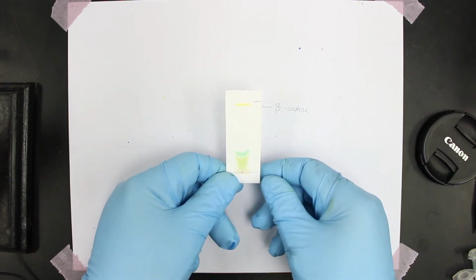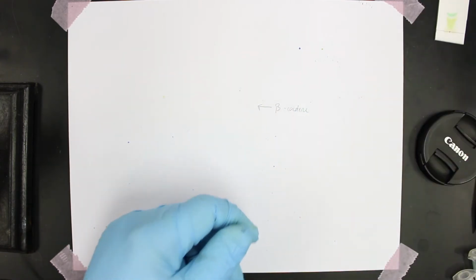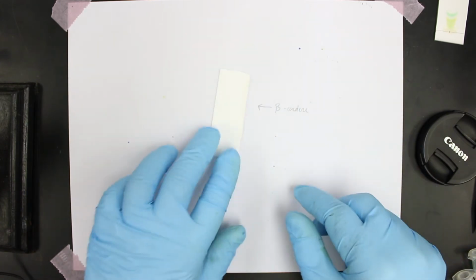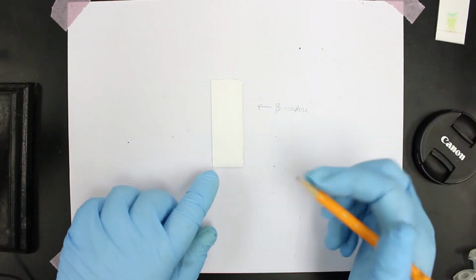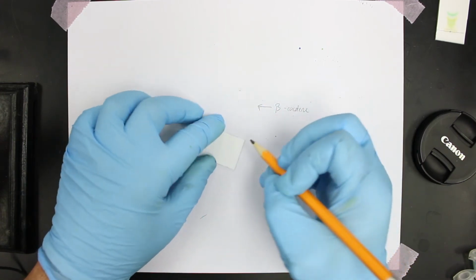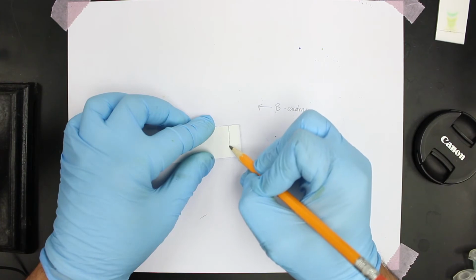Now, an issue arises when you want to separate compounds that are colorless. So in our next example, let's get another TLC plate, and this time instead of spotting one compound, we're going to spot two compounds. So I'm going to create my origin as before, try to keep it straight.